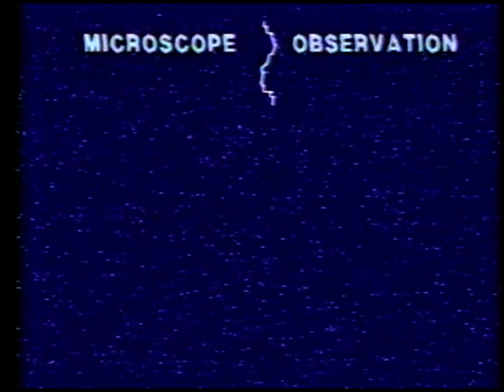This cartoon represents the way I now think long DNA molecules move, having seen them in the microscope. Suppose we start a 100 kilobase molecule in a partially elongated state, with its end-to-end distance at half its contour length. Assume a 1% gel with an electric field of 5 volts per centimeter. The tail of the molecule starts to catch up with the head for two reasons. First, the molecule exhibits so-called rubber elasticity because shorter states, like random coil, have higher entropy than the elongated states.